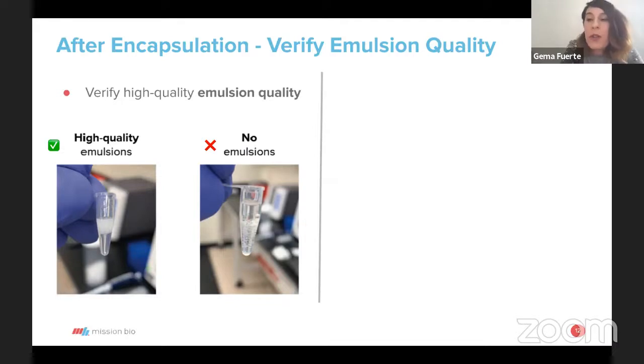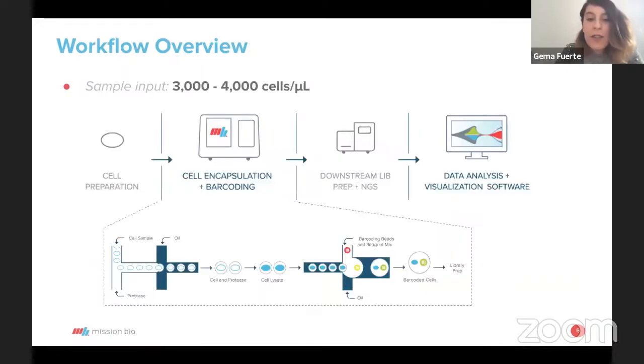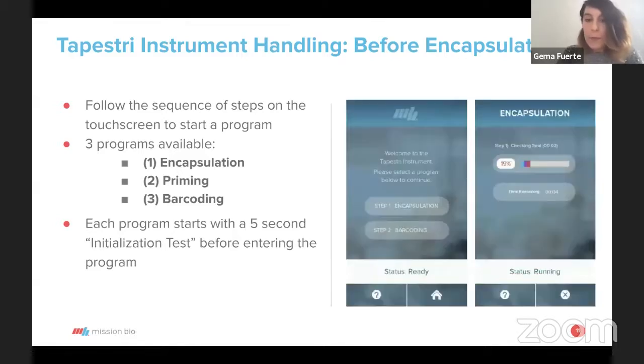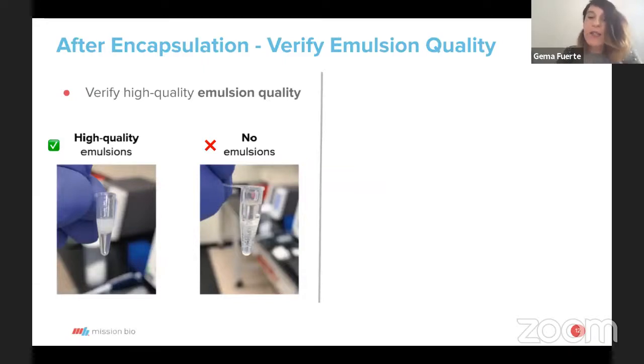Yeah, that's a good question. So the doublet rate at that concentration is around 5 to 8%. And actually, the doublet rate is not so much because of this encapsulation step, because we take good care of doing the 5% Poisson distribution. It is perhaps more due to handling, and that is what the next step I'm going to talk about. Great, thank you. Yeah, no problem. If you work with known cell lines, for instance, you could calculate the estimated percentage of doublets.